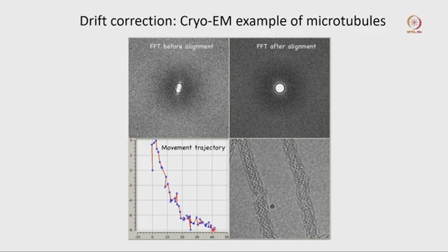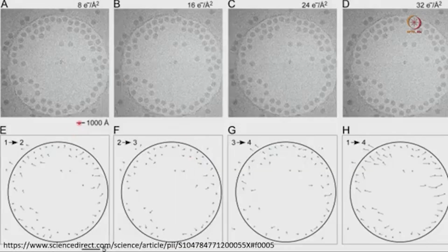These are telling you the movement of the different frames. Here we have a total of 40 frames. In some frames the movement is very high, and then it is very low, and then again drastically there is some movement, and again the movement is less. So, it is very difficult to predict what the movement of those virus particles or the protein sample will be.